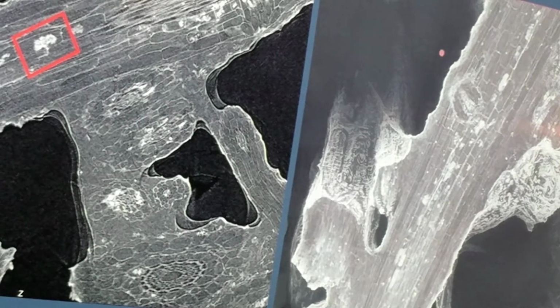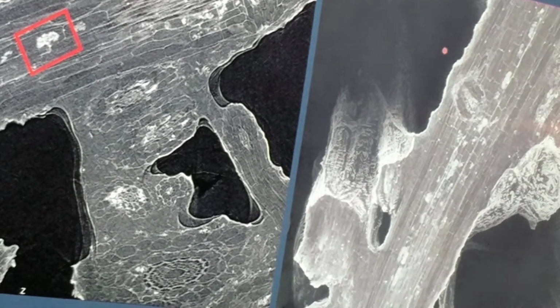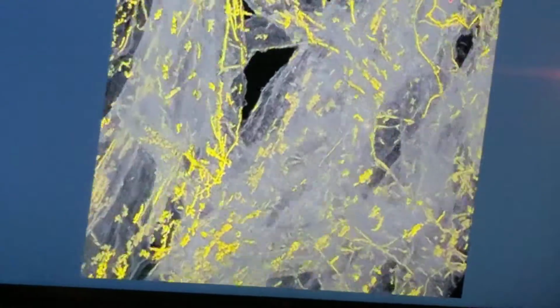Cool imaging, so what? Bring in Nee. 3D volume and mapped the entire thing. So everything in yellow is a fungus. Wow. So you can see the long stripes where the fungus is connecting all the different arbuscules, and then the roots are kind of in the background, transparent. We can now measure the entire fungal colony inside these roots.